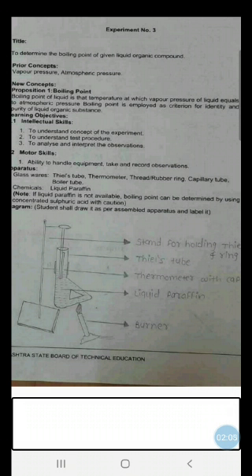In the last experiment we have seen why liquid paraffin is the preferred heating medium for such practicals. Liquid paraffin is a clear, colorless, transparent liquid. It has a high boiling point. It is an inert liquid, it will not react with any chemical. It is a stable liquid.